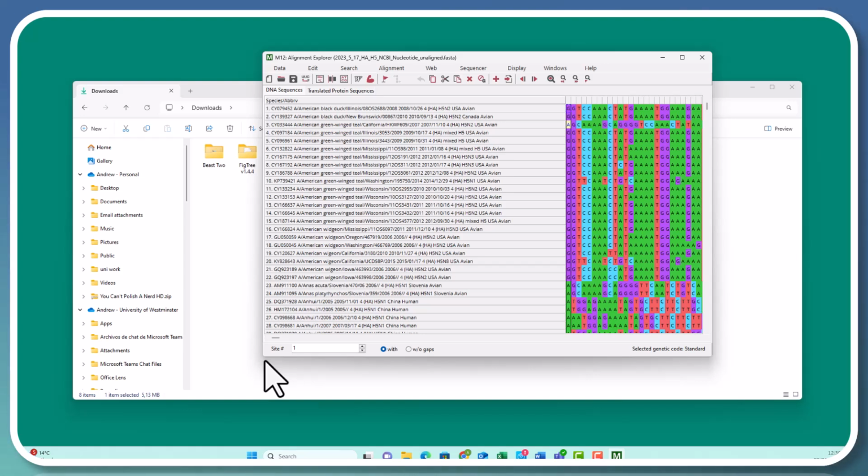If there is a single entry from a particular location and it's a very rare species, then I'm going to be a bit more conservative about the things that I delete or don't delete. So having the full header information in the file is important. So the first thing to do with any of your files is remove the gaps so that you're getting the information through.